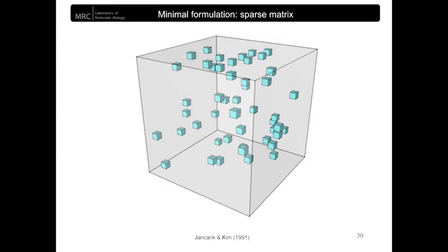Ideally, minimal screens should be formulated routinely and biased towards the characteristics of the sample investigated. However, the technical requirements for producing routinely various types of conditions and screens from a multitude of reagents are challenging. In fact, most crystallization facilities purchase standard minimal screening kits. More or less kits are combined to form a routine initial screen.